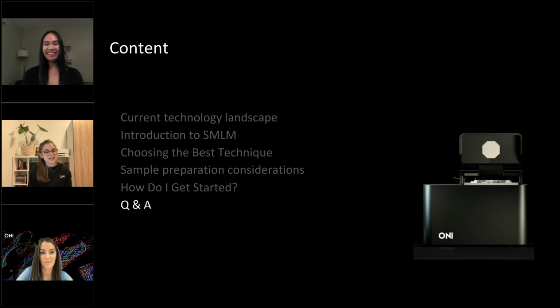Yes, so for your cell types, what is important, especially if you want to do localization microscopy, is that it's attached as close to the surface as possible. Because, as Vanessa already mentioned, normally with these techniques such as STORM, DNA-PAINT and PALM, we're using TIRF illumination to get a better signal to noise ratio. So what is important here is how you want to attach your structure to your microscopy coverslip. And there are different strategies, and it's not really depending on the origin, but a bit depending on what your structure is.